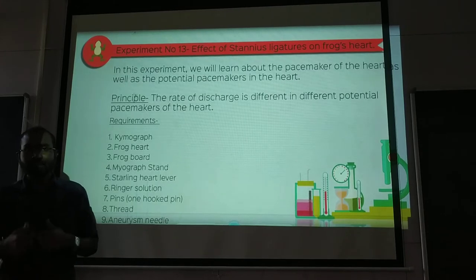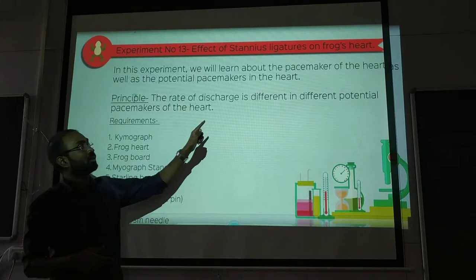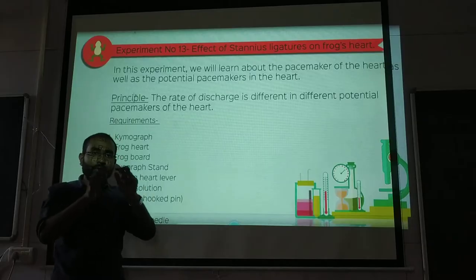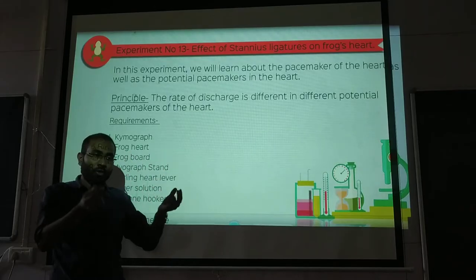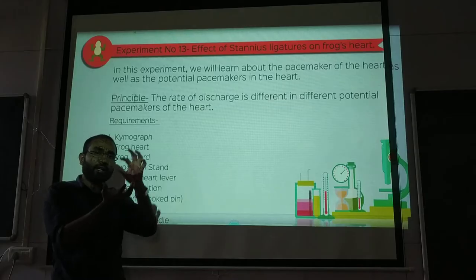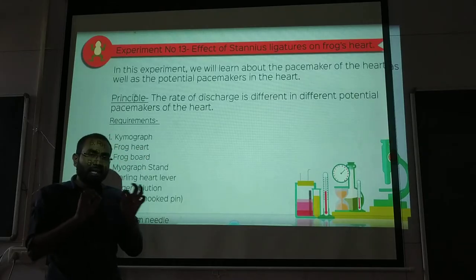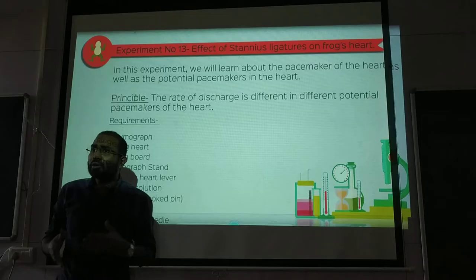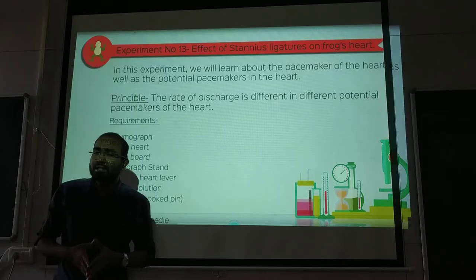In this video we will be discussing the effect of Stannius ligature on frog's heart. Stannius ligature means we will give one knot to one part of the frog's heart, and another ligature in front of the frog's atria and ventricle. Different ligatures will be given and we will study the properties — what different properties we can derive.